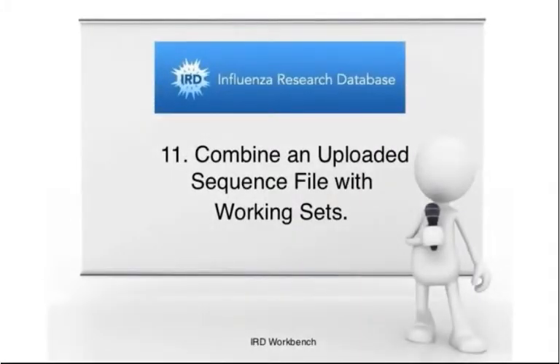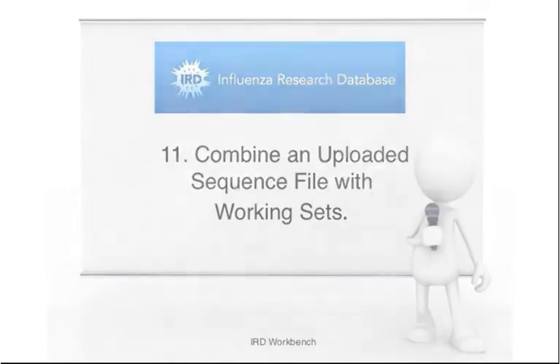Combine an uploaded sequence file with working sets. If you have your own sequences and want to analyze them with IRD sequences in an IRD tool, such as aligning your sequences with IRD sequences, you can do so by uploading your own sequence file to your workbench. Then combine it with one or more working sets to construct a new working set and perform various analyses on the combined data.